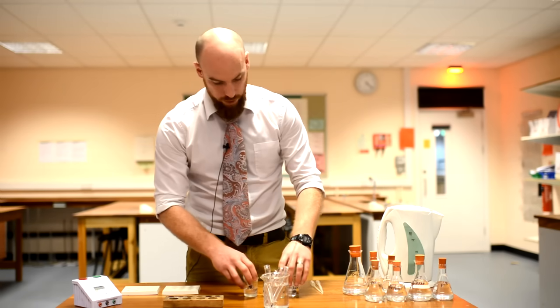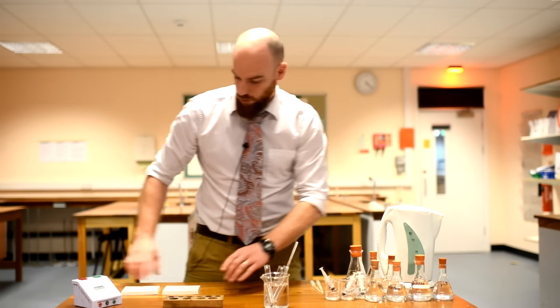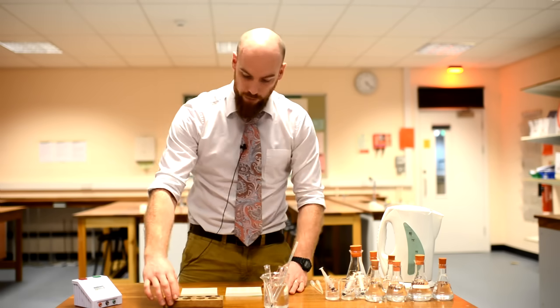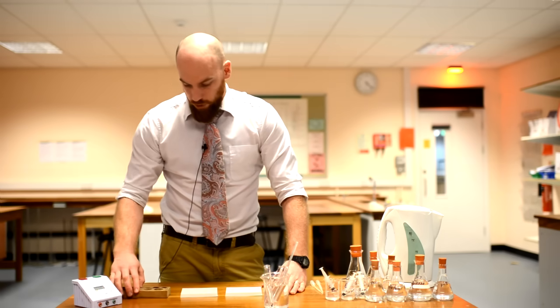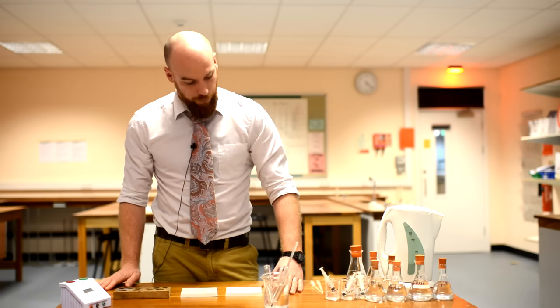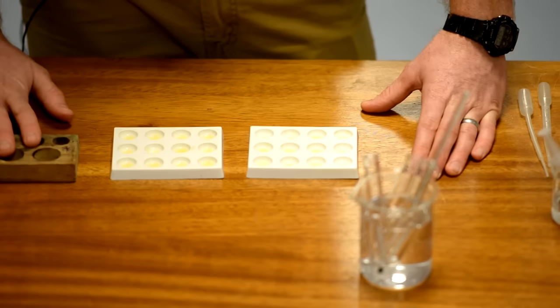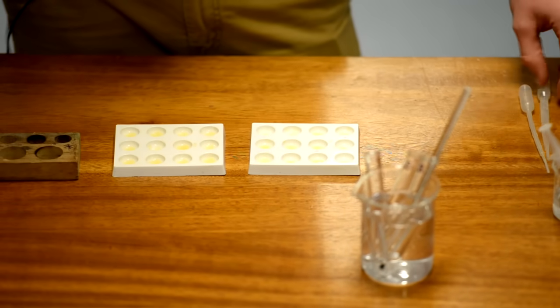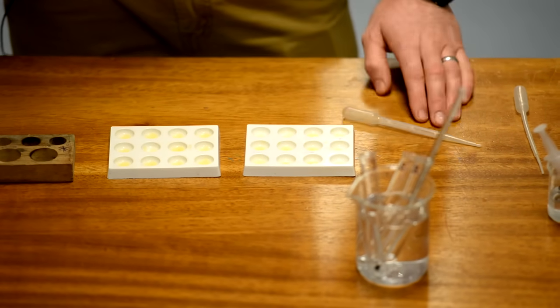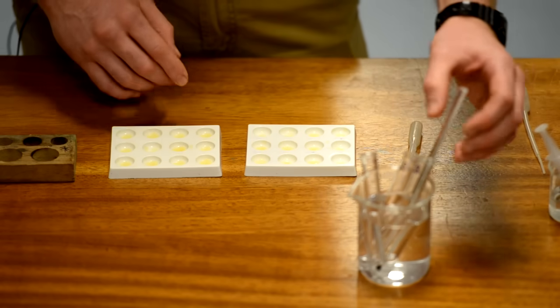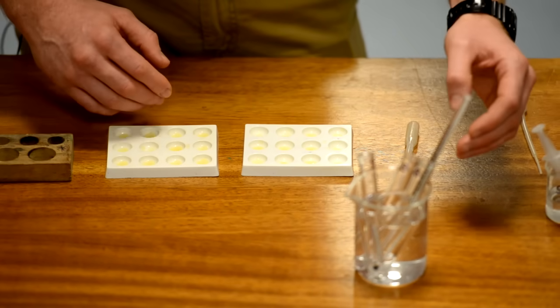And focus your attention now on your spotting tiles. You'll also need a test tube rack, a timer, and a pipette. We already have in our spotting tile the iodine solution which, if it turns black or dark purple, is a positive test for starch.